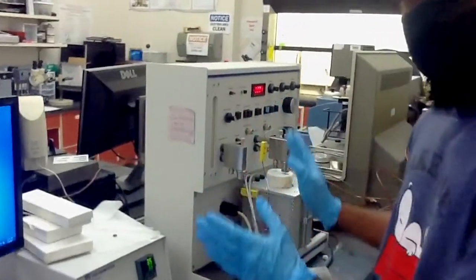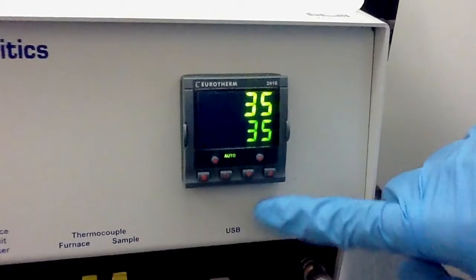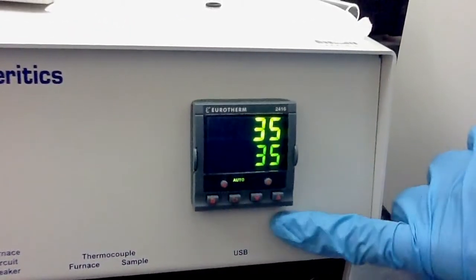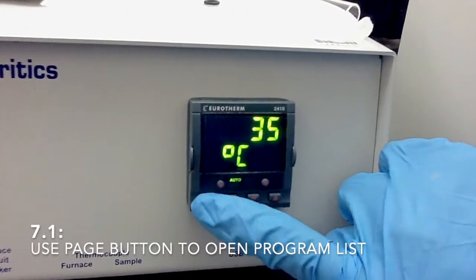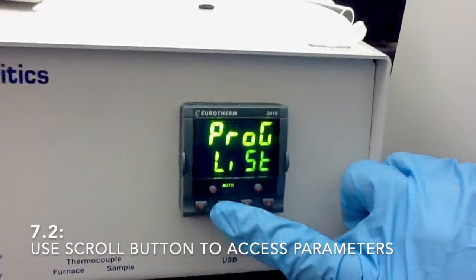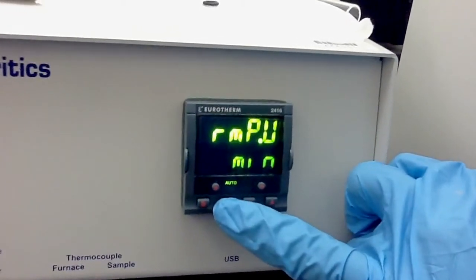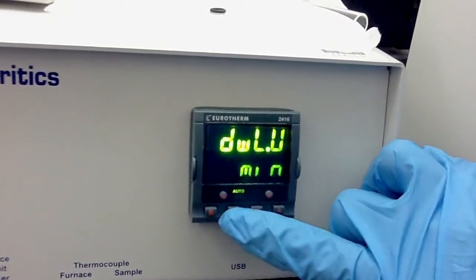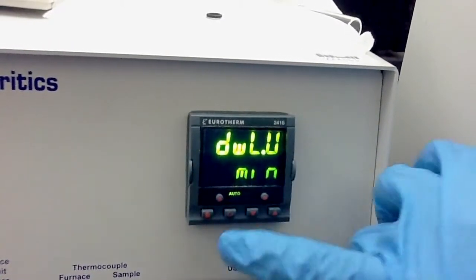For this temperature program, we have to use this PID controller here. This PID does have 4 different buttons. We use these 4 different buttons to set our program. This one you can read here is like a page. You press this one, it will open this program list, and select this circle, so it will go to the program list, and then go here. This is called ramp per minute. This is how long it will stay on that set temperature.